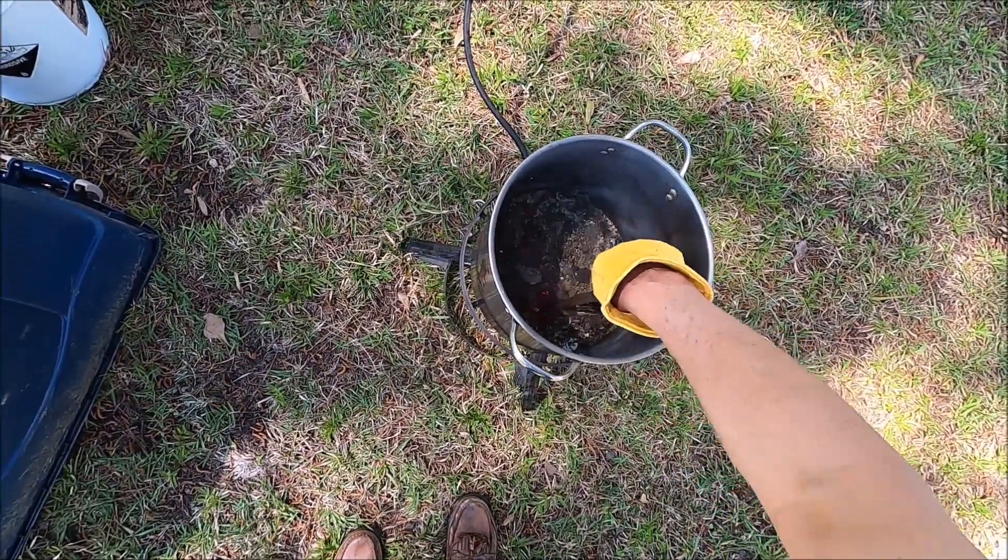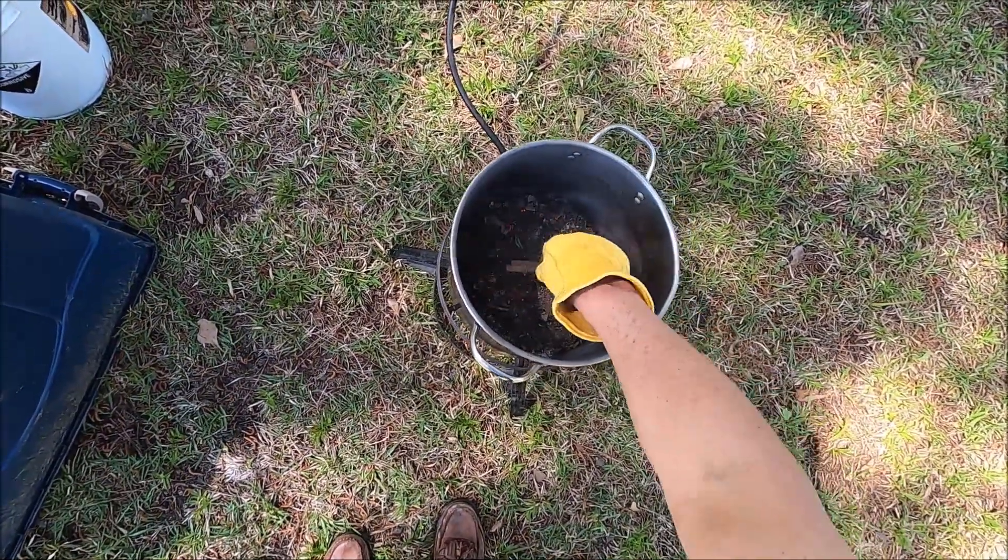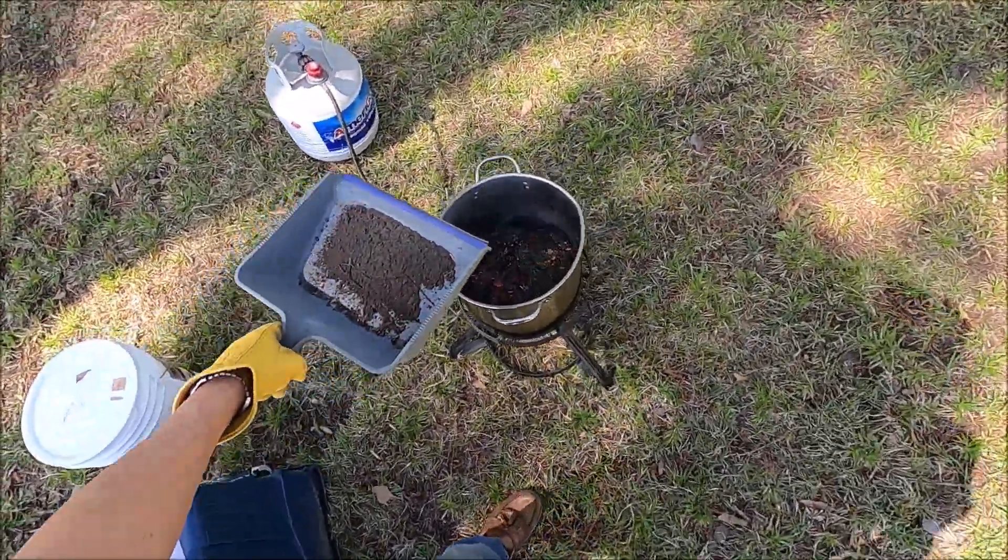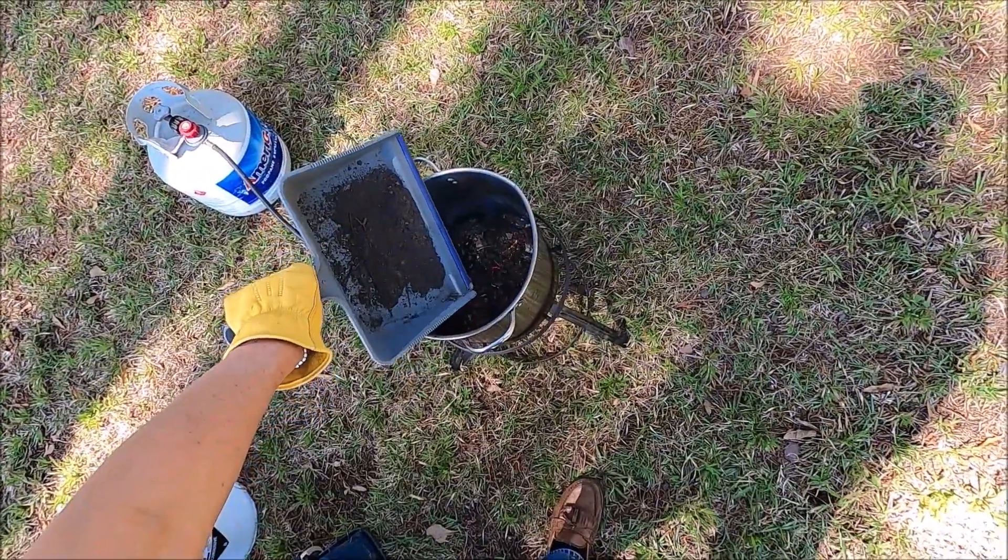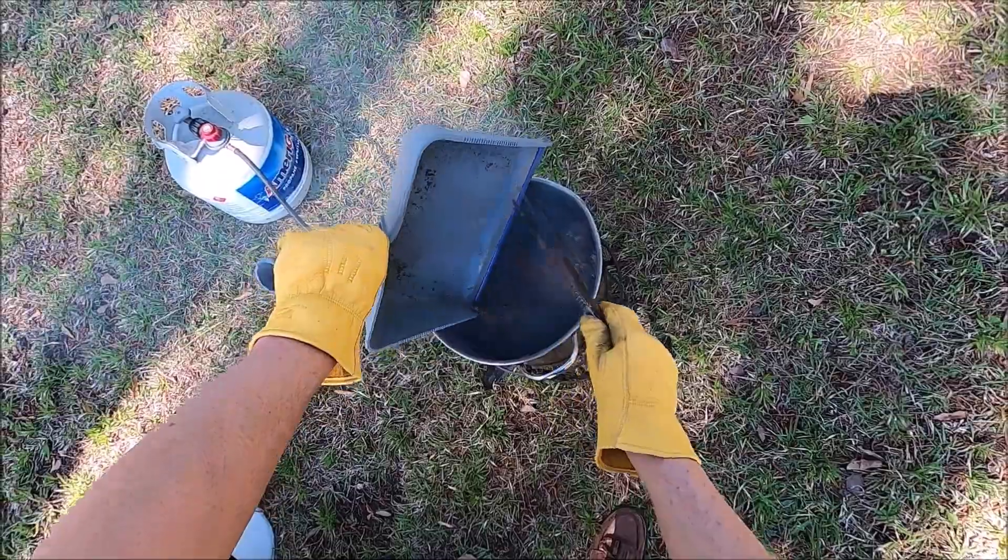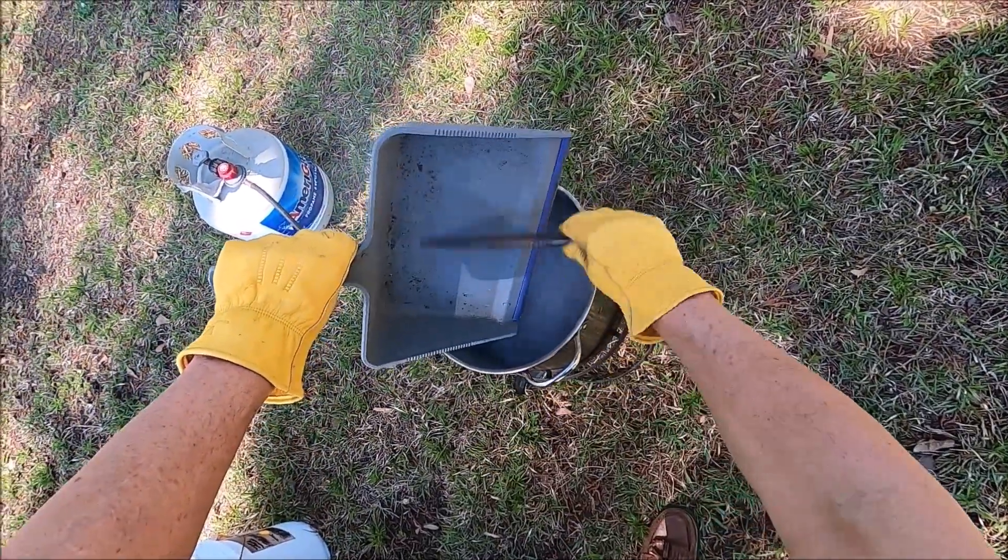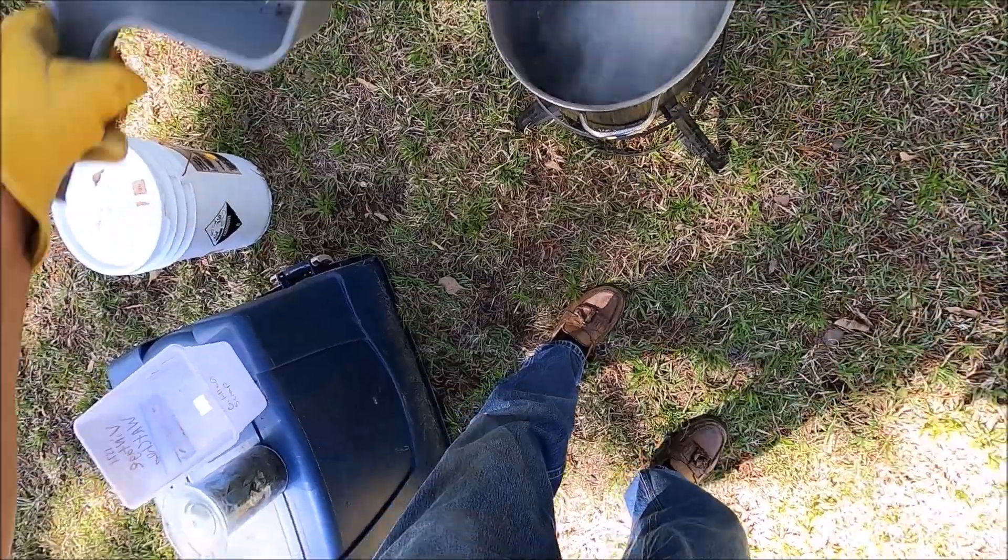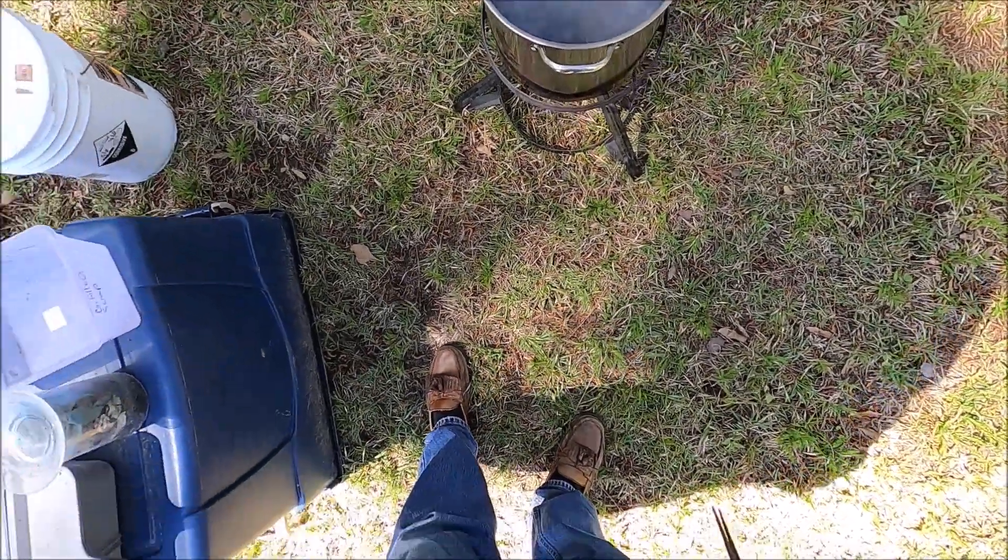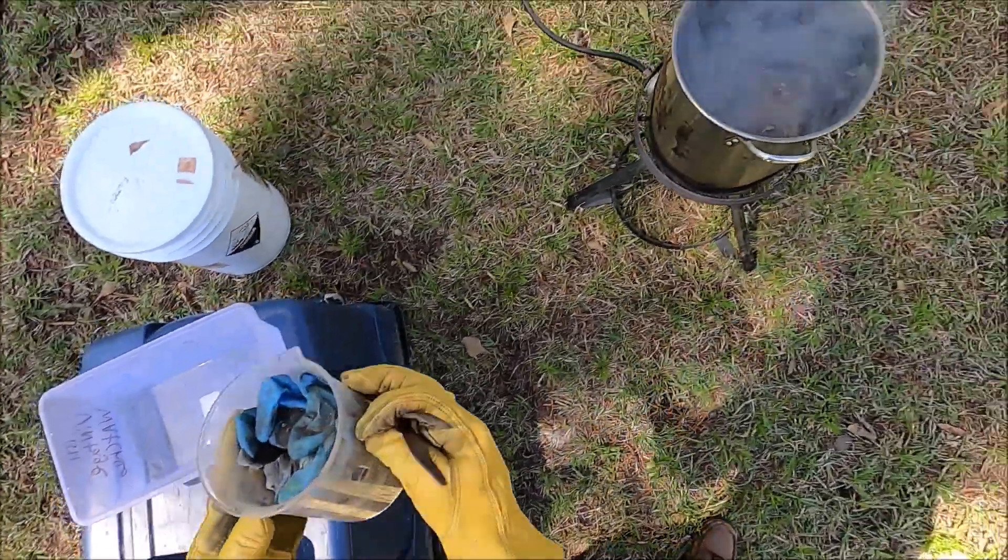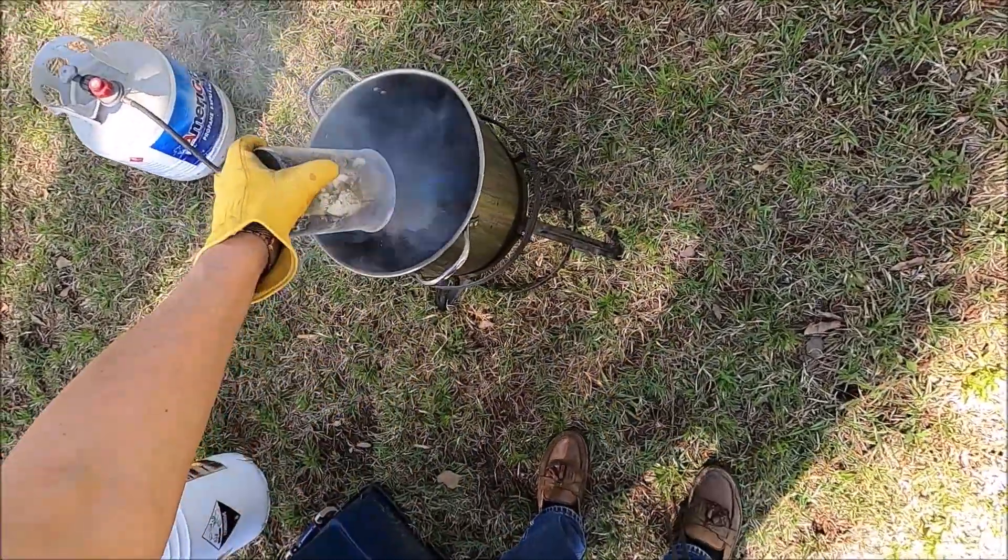That first group of paper is already burnt to a fine ash as you can see there. Now I'm going to add the scrapings off the back of the baffle out of my fume hood. While I had that baffle out I scraped all that material off of it and I saved it just in case it contains any precious metals.